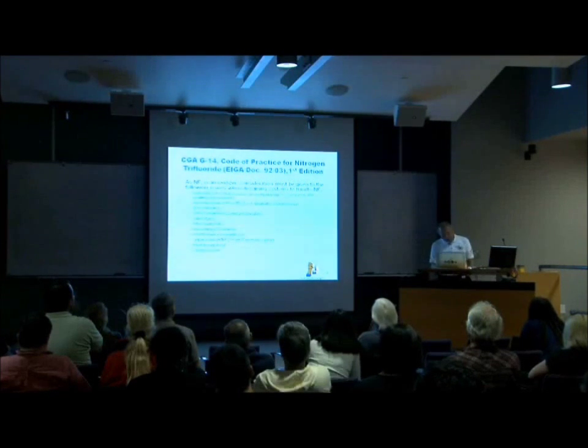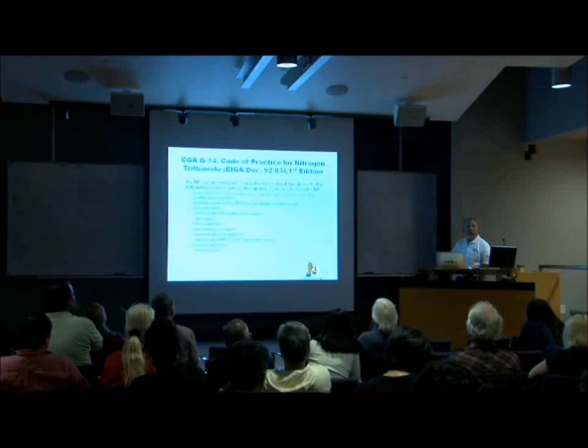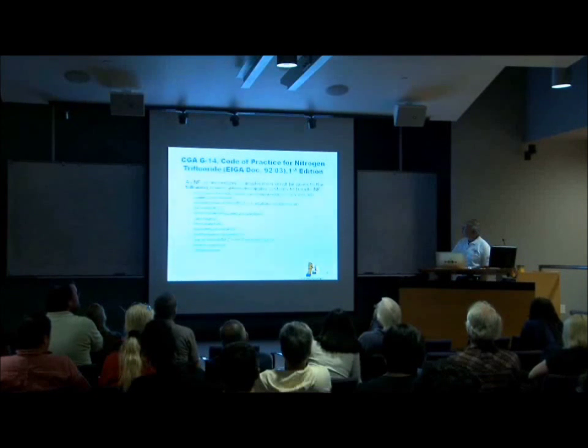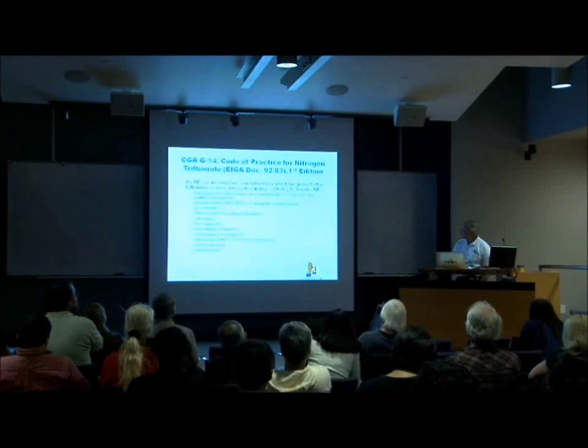This is a code of practice for NF3. Anyone use nitrogen trifluoride here? Nitrogen trifluoride is a very common reactor cleaner that's used in semiconductor reactors. They use a plasma to break it apart into very reactive fluorine.